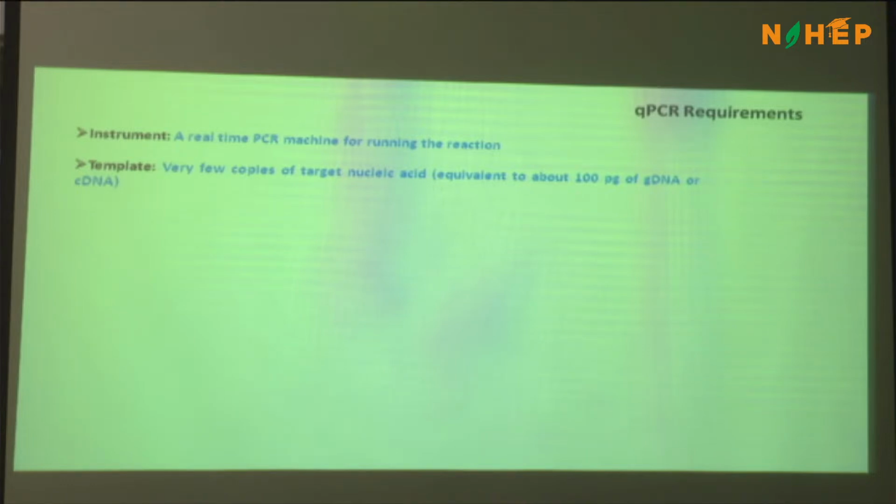It can be anything. It can be from the microbiome perspective, maybe a sample which is exposed to microbiomes and collected in different timelines. The sample what was given to you yesterday was something like that. A rice plant which is exposed to certain bacterial communities, and the samples were collected at different time points, I think 0 and every 24 hours up to 5 days, and you are monitoring the activity of a defense contributing gene, and you are trying to make some interpretation whether microbiomes can activate some of the defense pathways in the plant. So template is very important.